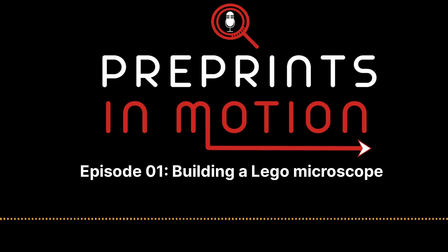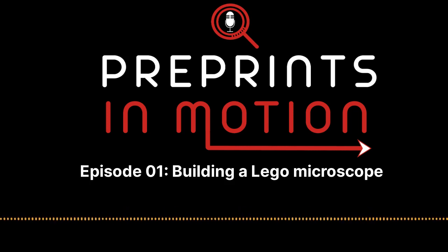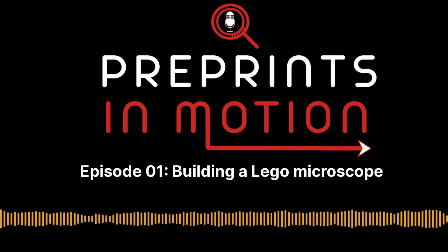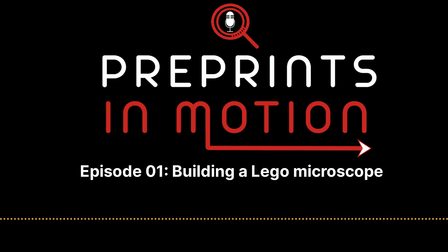And presumably, with what you've built, you could upgrade the components and the lenses and things to make it better. Exactly. Yes. Of course, everything comes at a price. So if you want to pay more for your optics, you get glass optics. And then, of course, you are more vulnerable, but also better. So these plastic lenses we have, they're really not that good. But they're not going to break as easily if you drop them. Exactly, that is an advantage.